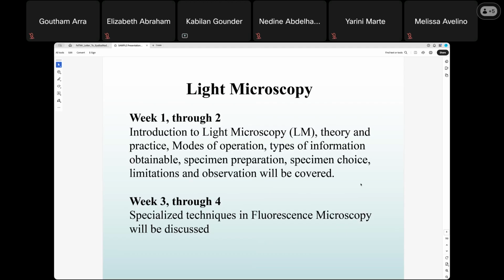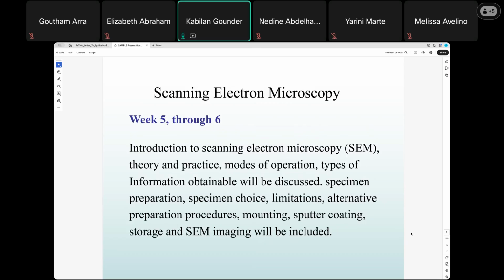So that is our first few weeks. We are going to discuss light microscopy, also fluorescence microscopy. That is, how important is fluorescence microscopy and why we want to use it, even though we already discussed light microscopy, which gives you the structure. What else are you going to get from fluorescence microscopy? That we will discuss in the following weeks.